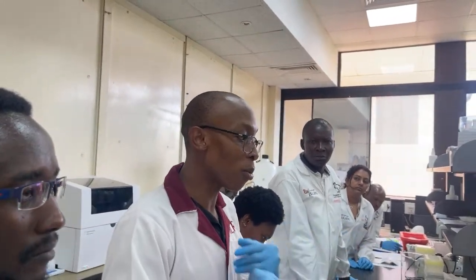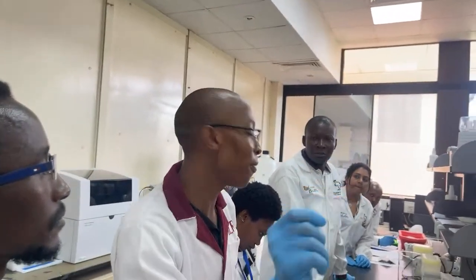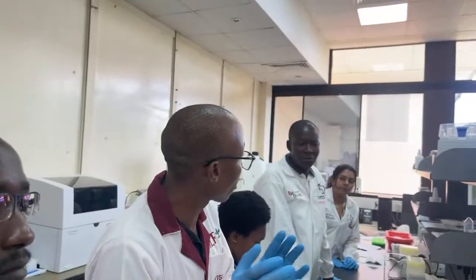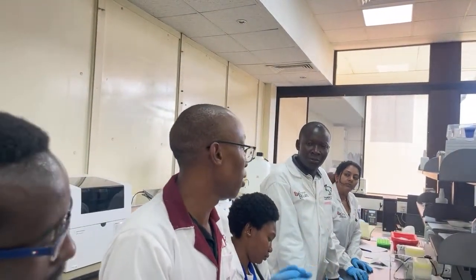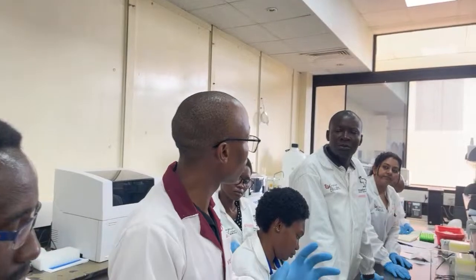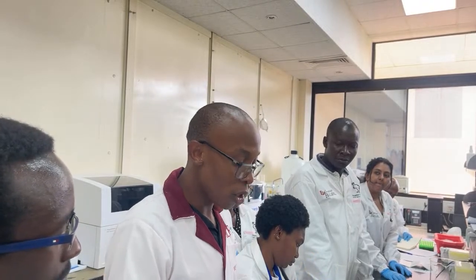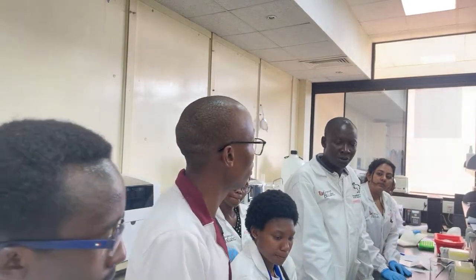With the columns, for example with the Zymo kit, when you buy a column, let's say a 5 column or a 25 column, that's the binding capacity of that column. It can bind 5 micrograms of total DNA, or up to 25. In this case, with the Nanobind, we are not limiting; we're trying to get as much out of a cell as possible. That's why we use that disc, so that the DNA itself is nicely wrapped around the disc without any limitation. The matrices all have different binding capacities, and that's one of the main differences.